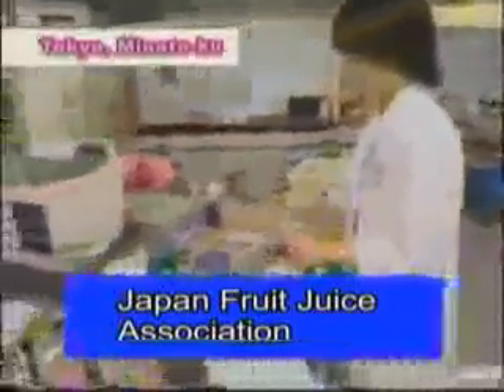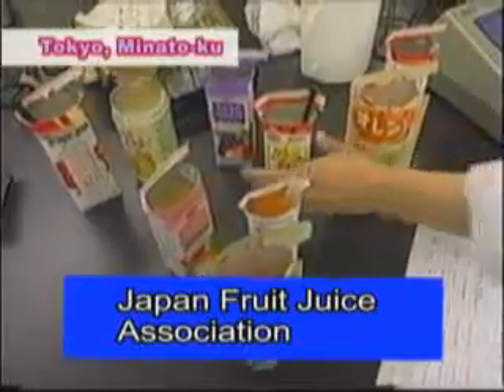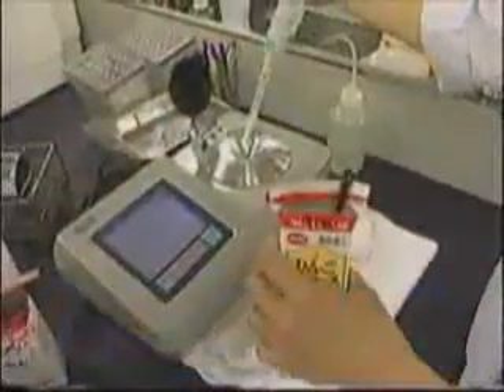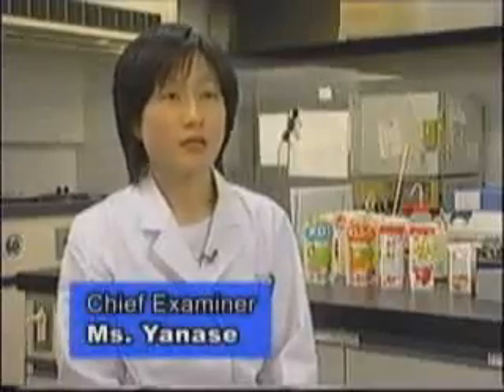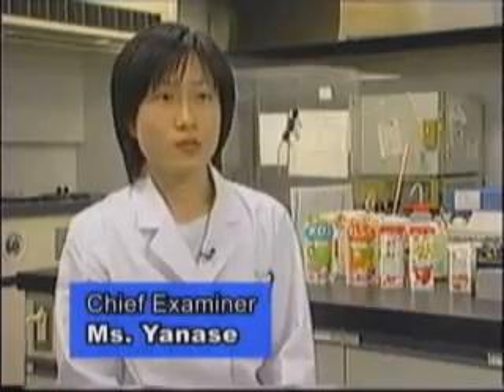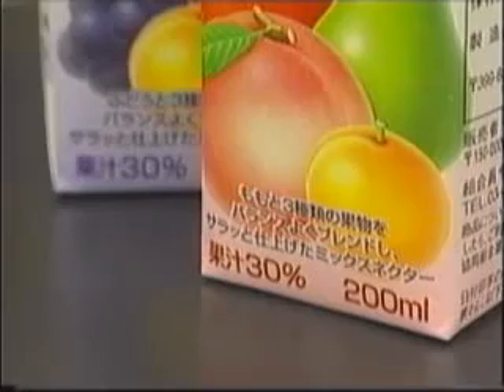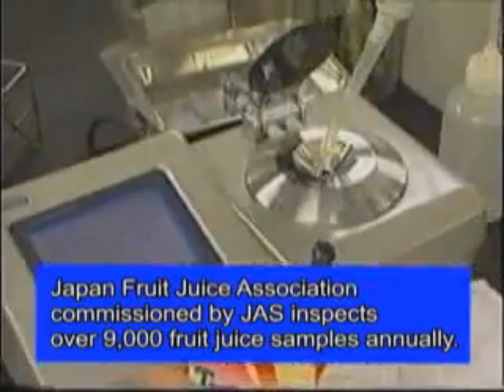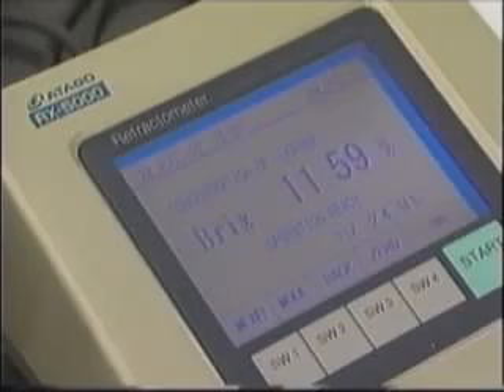The Japan Fruit Juice Association inspects the density levels of drinks and juices released each year with Atago's latest refractometer. We examine the densities of fruit juices produced by beverage manufacturers. By measuring product samples, we check whether density levels are properly indicated on the package. In this process, we use Atago's refractometer at an accuracy of 0.01%. As manufacturers only control their products' quality in units of 0.1%, for closer examination, it is necessary to measure in units of 0.01%.